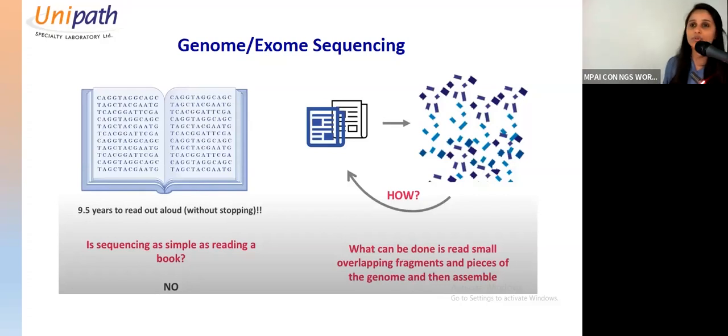So how do you handle it? You cannot just be looking at the raw reads and deciding what is going to make a difference. For handling this type of data, you need a tool.